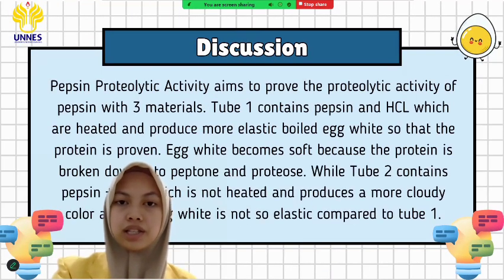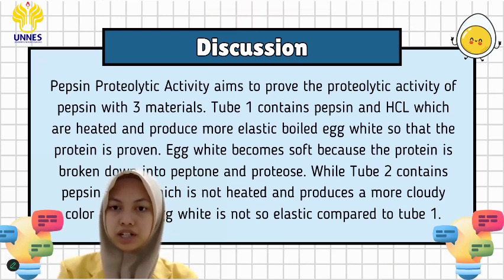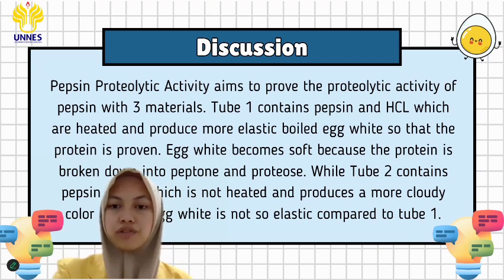So, the discussion of the proteolytic activity test of pepsin was carried out with 3 treatments. The first treatment was the provision of the same material, pepsin and HCl.